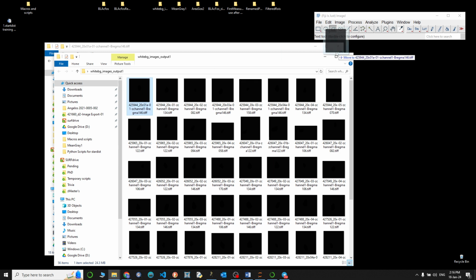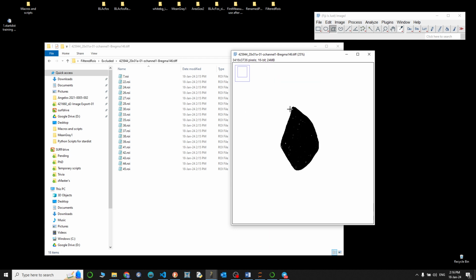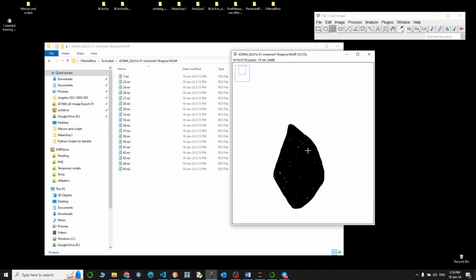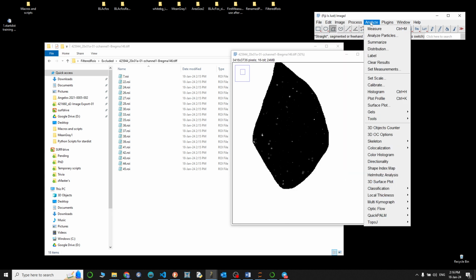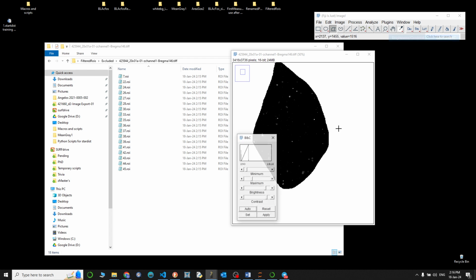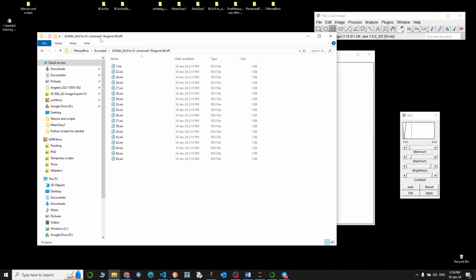All right, let's open the first image, and before I put the excluded ones, let me actually first make it a bit more visible for you, because I don't know what your screen's brightness is and everything. All right, let's see. Let's say that we have something like that.